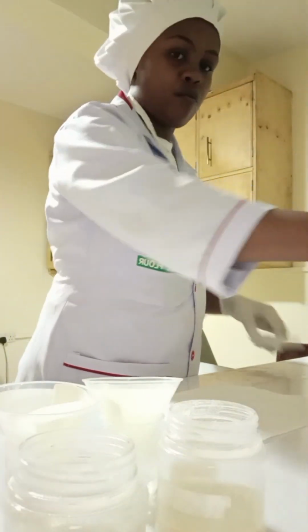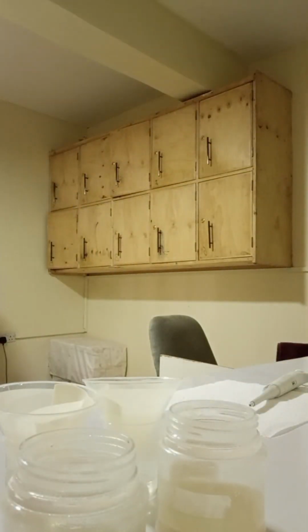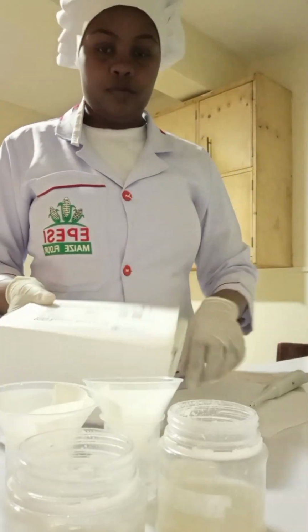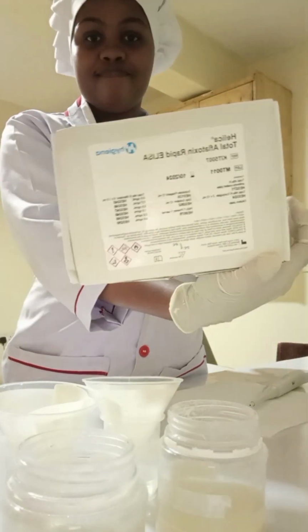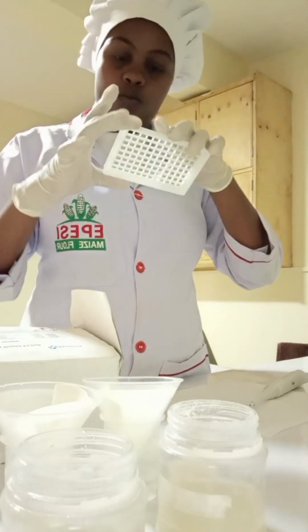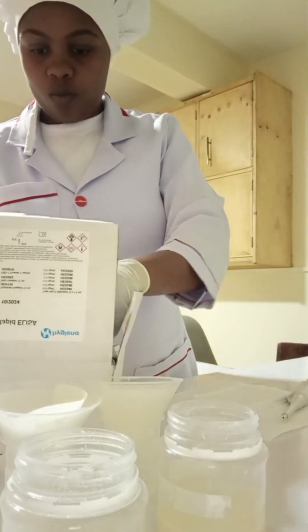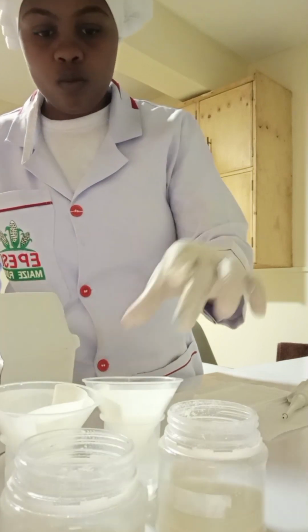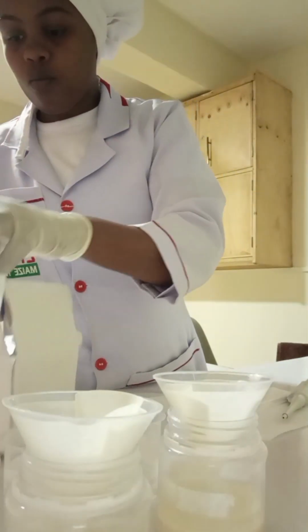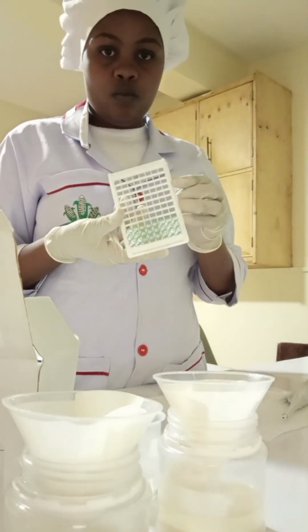Now you see the next step, you use this kitchen towel. You place it there, and on top of it you do the test. You place the plate and the wells where you do the mixing and everything, so that you can run the test. That's the kit I was holding, the box.